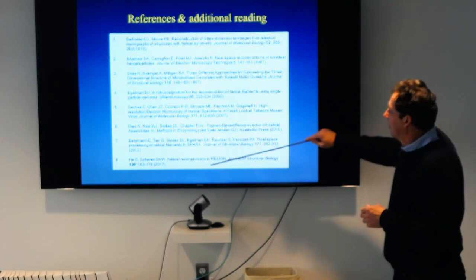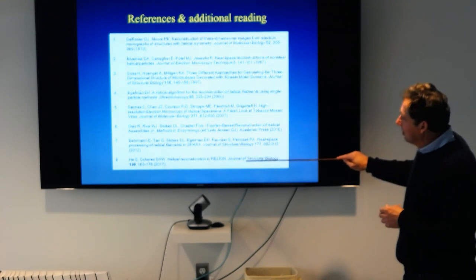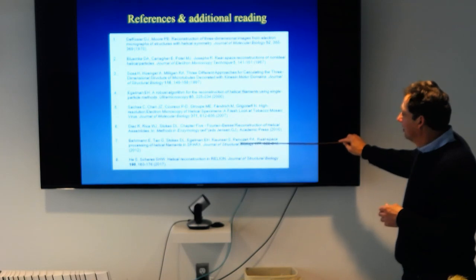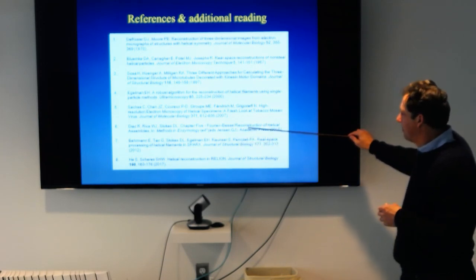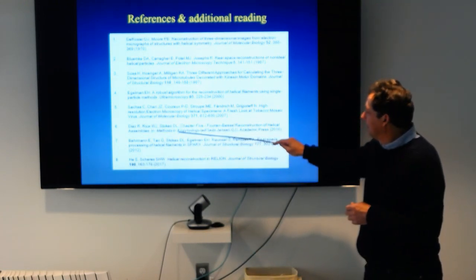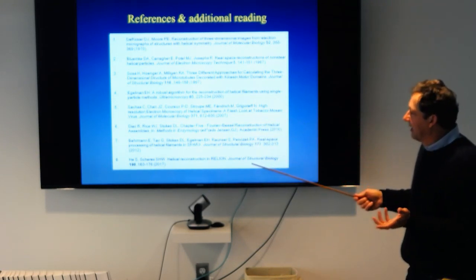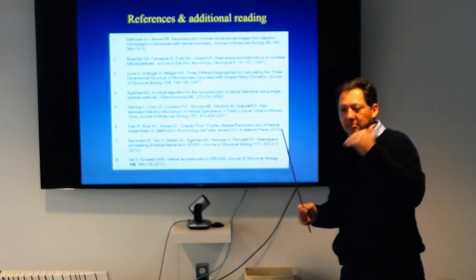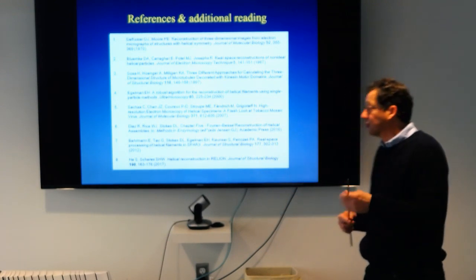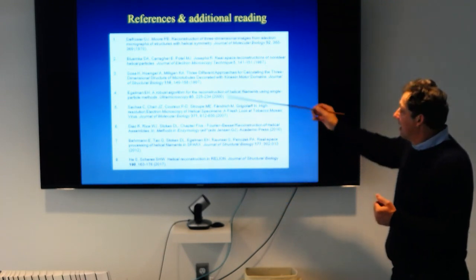So here is where they describe RELION. A more theoretical one, if you want to see, is a relatively recent paper by Ruben Diaz and David Stokes, where they describe their Fourier-Bessel reconstruction method. It's good to go over what I just said about the layer line and the origin of the Bessel reconstruction, even if you are not going to use the Bessel reconstruction per se.